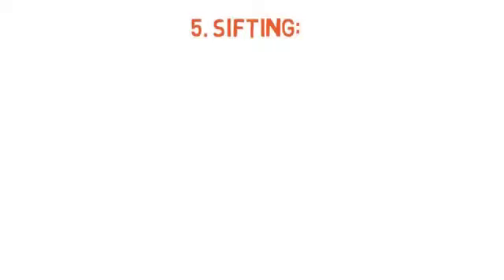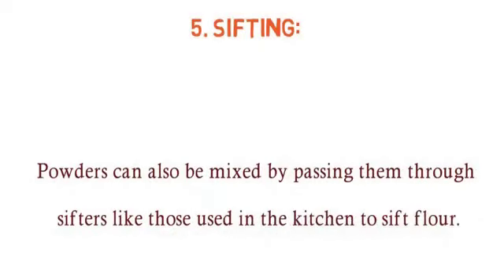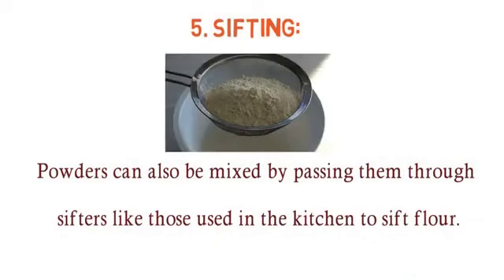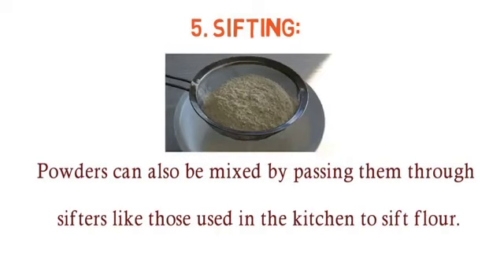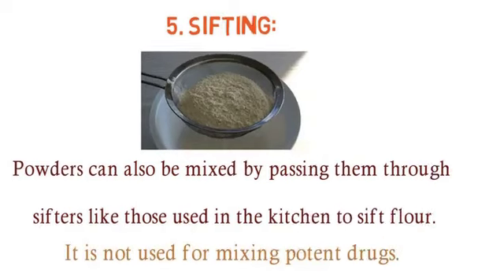5. Sifting. Powders can also be mixed by passing them through sifters, like those used in the kitchen, to sift flour. It results in light and fluffy product. It is not used for mixing potent drugs.